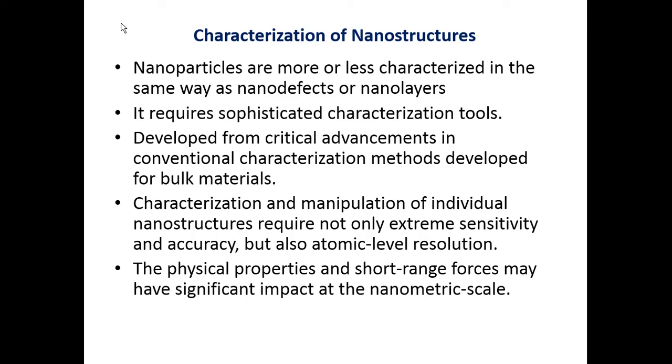Characterization is actually the measurement of the thin film formed in nanostructures and their surface quality measurement.